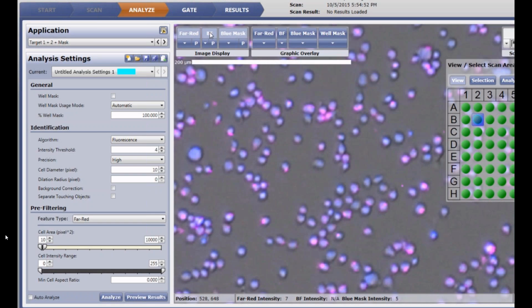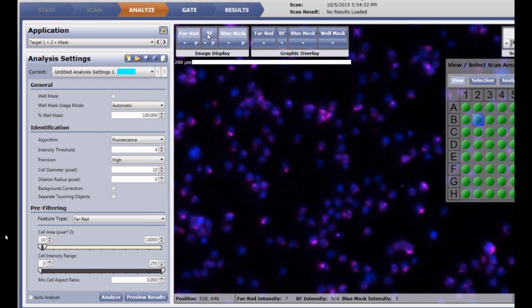Now you can see a little bit better that the antibody staining is present. It's just very dim, and I did use quite a bit of high exposure. Ideally, if you have a better antibody, then I would use that. But sometimes you just don't have that luck.